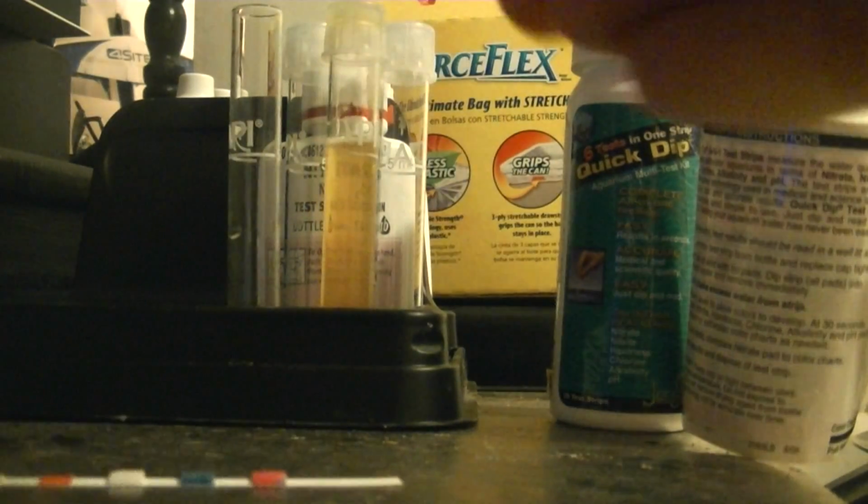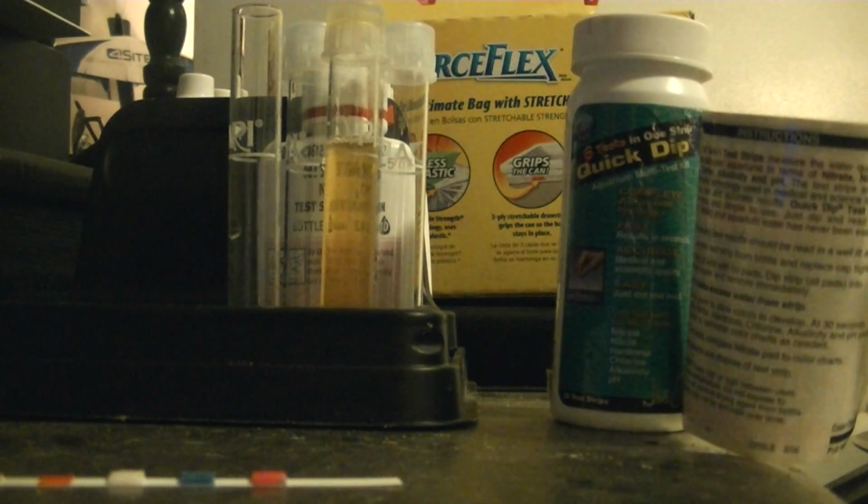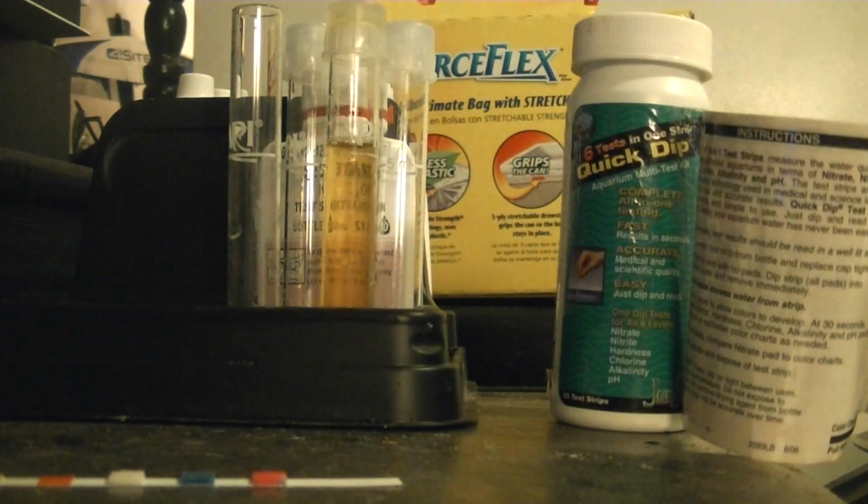Now I haven't been watching the timer. Usually I would count this out or watch a timer, so I'm not sure. I know I talked a little bit while shaking this, but I'm just going to put it down now. Now a complete yellow color is best. So we got a little bit of orange. That means I do have some nitrates in my tank.